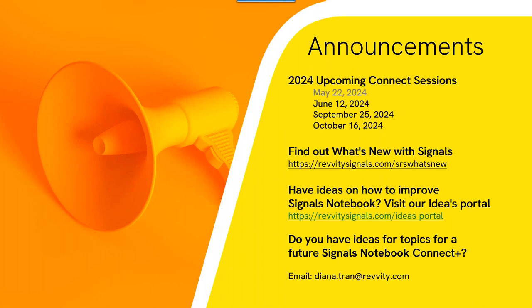So that's within the data and results model, where our team of experts help roll out the model or work with your team to do so. We would create a very parsimonious data model to help you understand the end-to-end process that you require, and so you can see the data connecting them. So that's one simple answer.